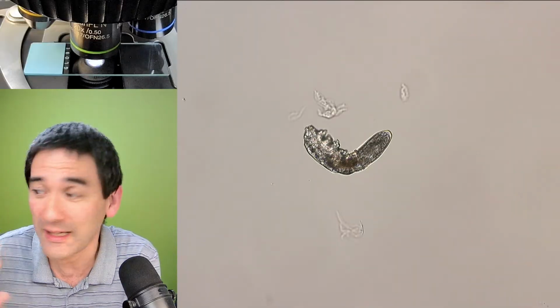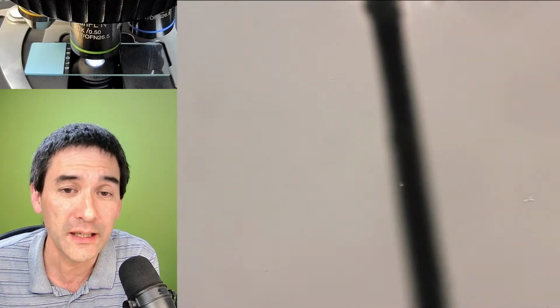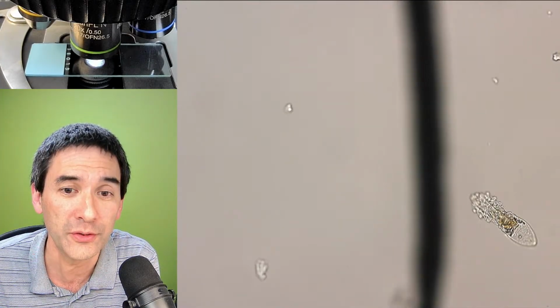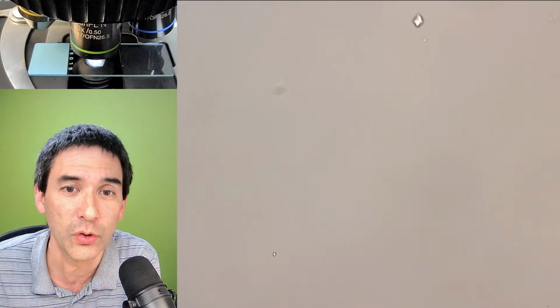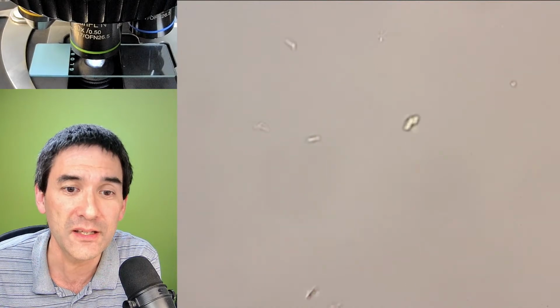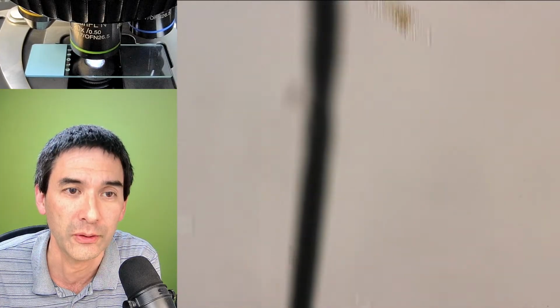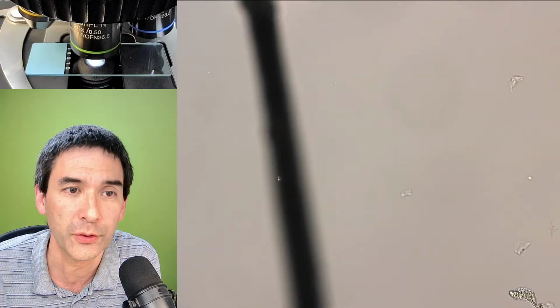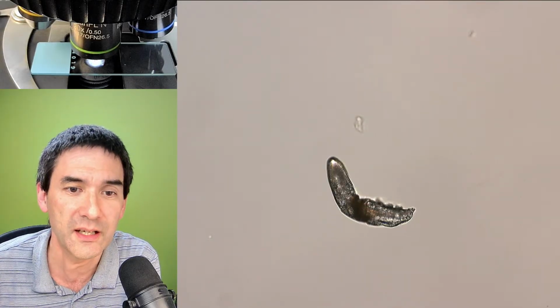And before I say hello all around the world, I'm just going to show you, this is the first face mite. Then down here, this is a dead one. Okay, it's pretty transparent already. And then I think a third one is over there somewhere. I don't know exactly where. Yeah, I have to find it. But in any case, there are three of them around here. Let me go back here. I think it's a little bit further up. Let me find it. Here it is. Here's the third one. This one is also alive.